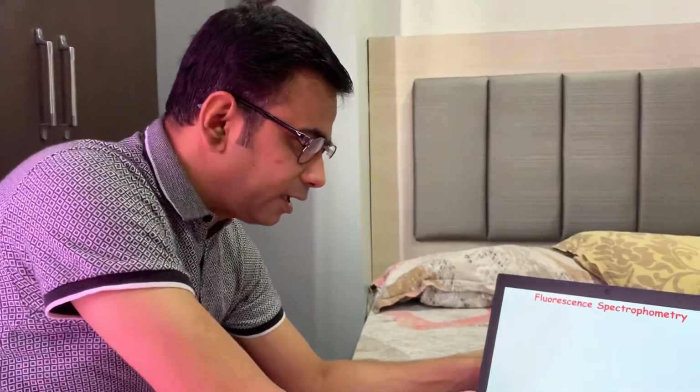Good morning, students. I have already sent you some videos regarding plant and molecular techniques, and we have also discussed UV spectrophotometry before in the virtual class. Today I will try to give an overview of fluorescence spectrophotometry.